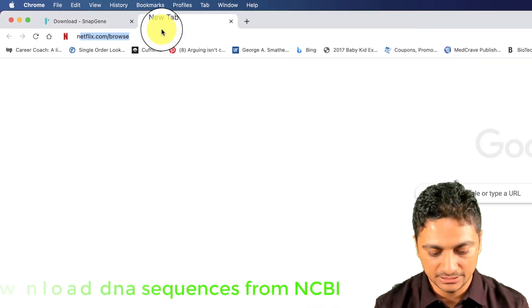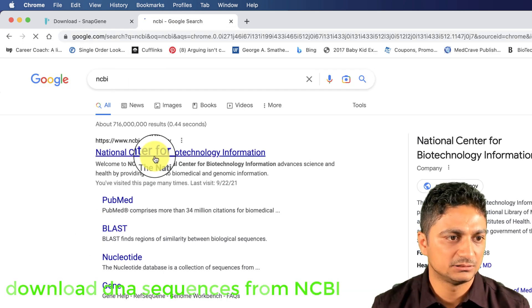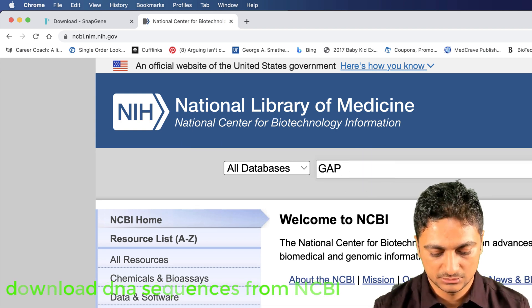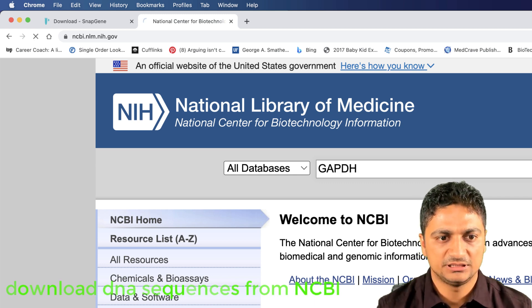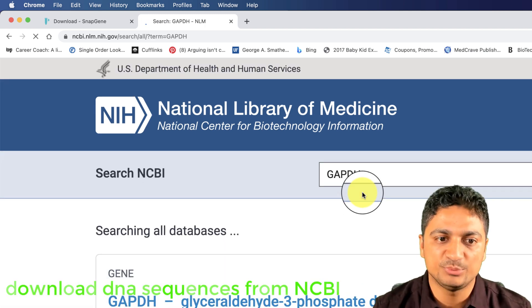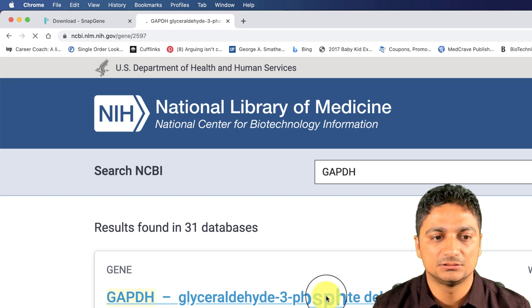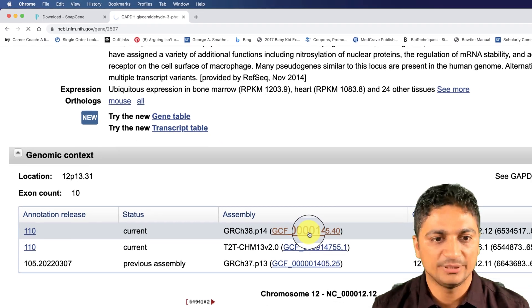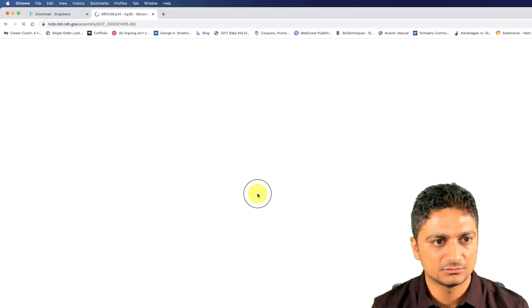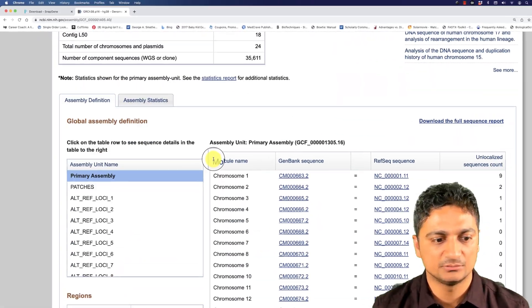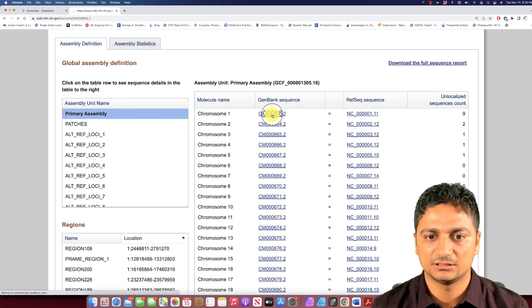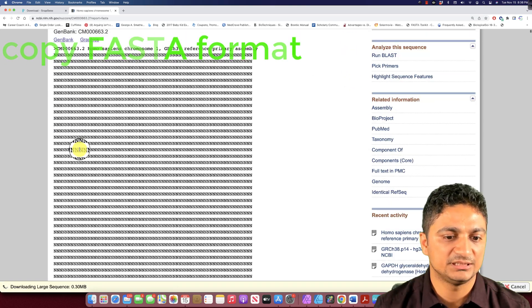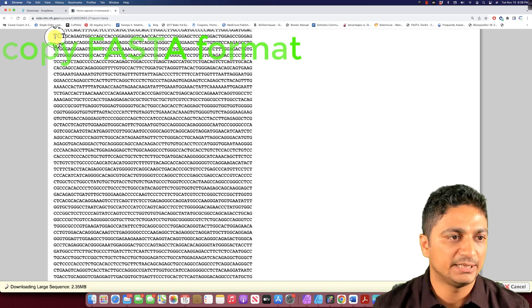Let's go to NCBI and download a sequence from there. I'll search for GAPDH — this gene is mainly used as an internal control in qPCR and gene expression analysis. Let's download one of the gene sequences. You can copy the gene sequence from the FASTA version of the sequence, which makes it easier to work with.